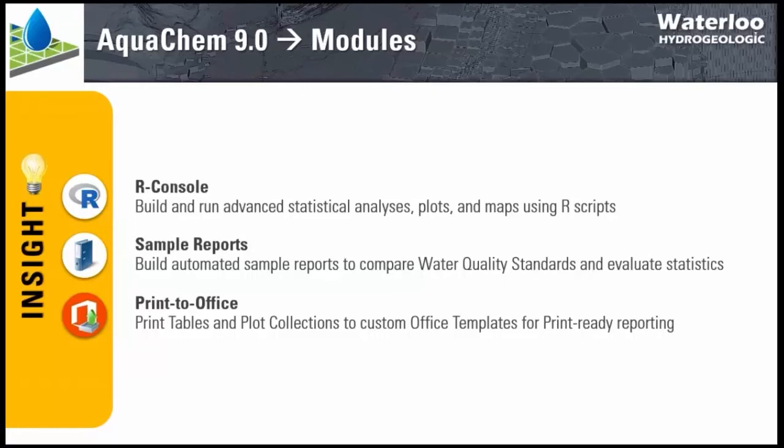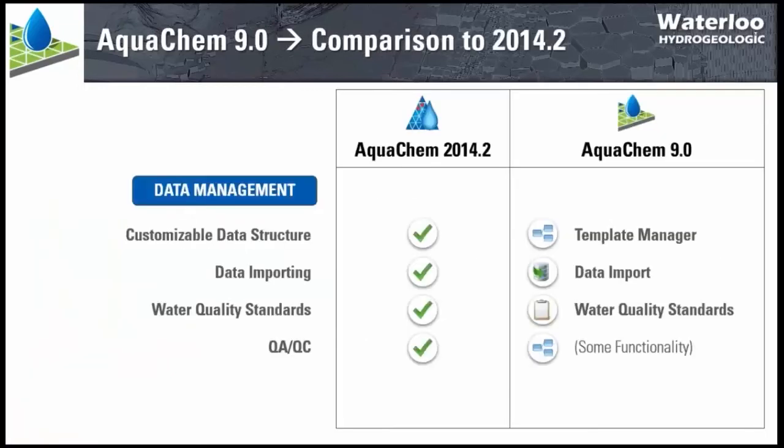In terms of facilitating report generation, we have the print to office feature, which allows you to print your tables and plot collections to custom office templates that are print ready so you can build them directly into your reports.